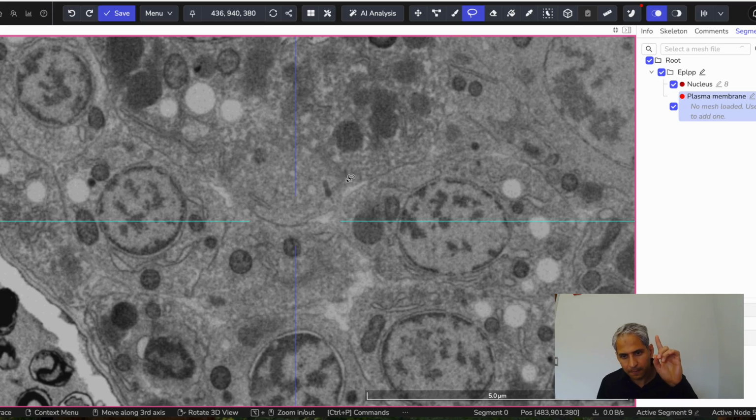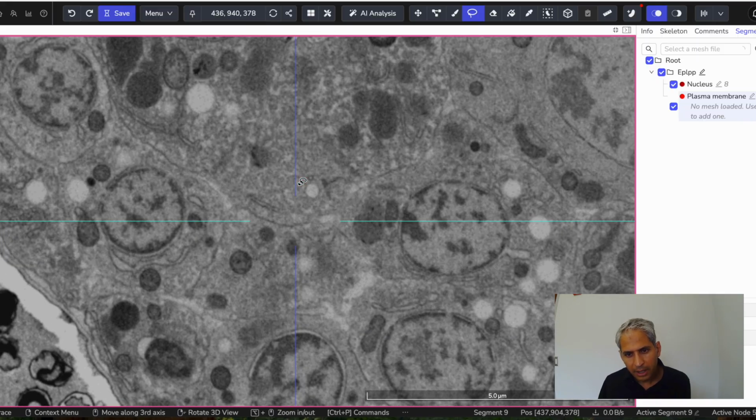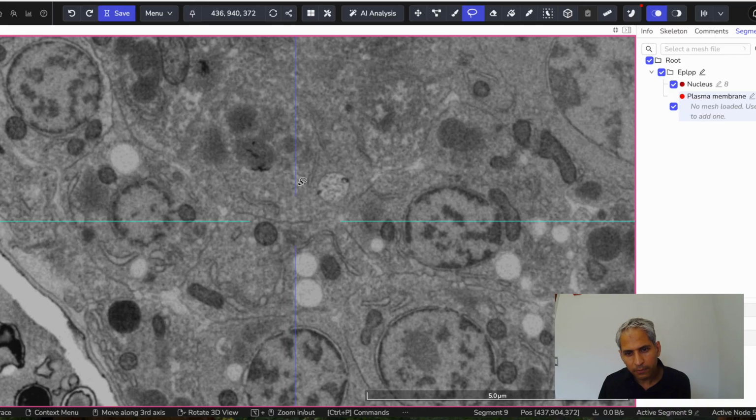So I'm going to say, educated guess, that I'm going to trace like this up here. And then I'm going to go somewhere in this dubious region, and then I'm going to come down nicely around my cell. I can feel confident. I did the best I can. Slice number 3. Let's use interpolate. Let's go up and down. Yeah, I think that's a good idea. And then let's do a little bit more.